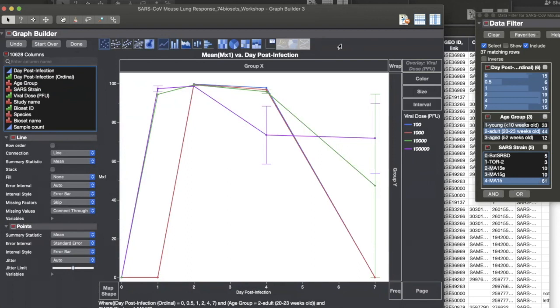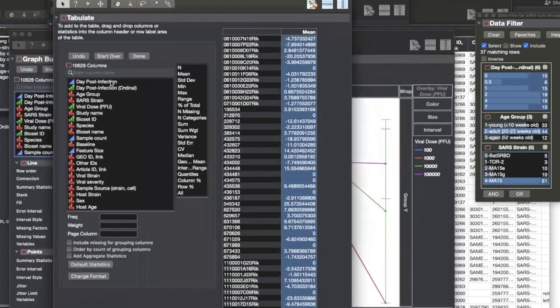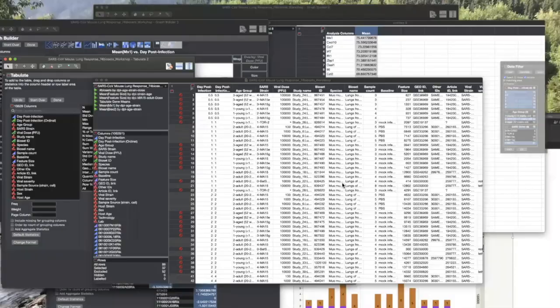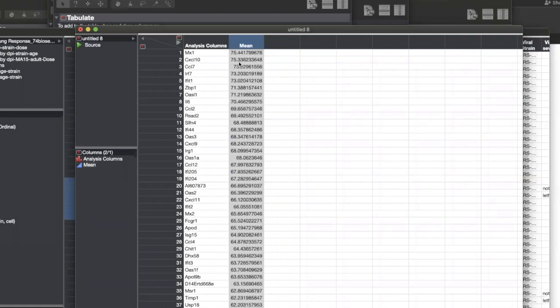And if we actually look, this is what I do: I'll go through and look at these genes, and I'll tabulate... wait, where's my table? Just doing some simple analysis, and there's a lot more stuff we can do. We could sort this descending. I find MX1, I can take that, and then I can look it up. And then I actually looked up that gene.